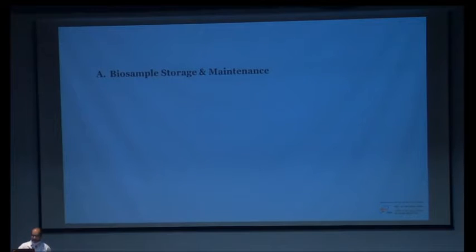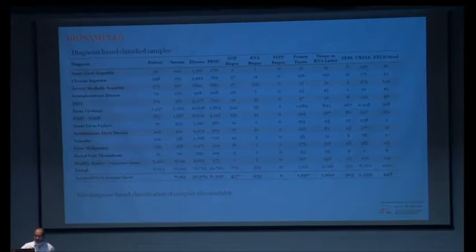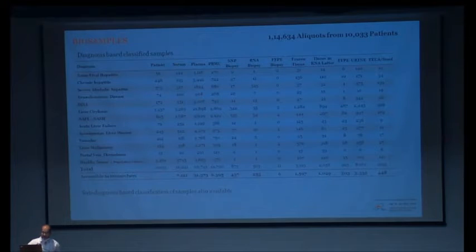Now coming to the first part, that is the biosample storage and maintenance. We started late in 2018, and full working started in early 2019, and then 2020 and 2021. Till now we have collected approximately more than 1 lakh samples from 10,000 liver disease patients.